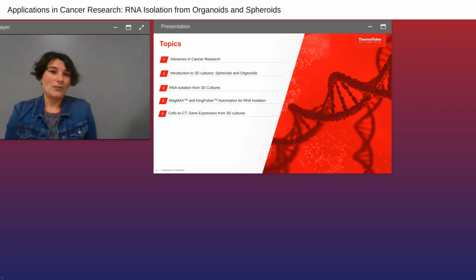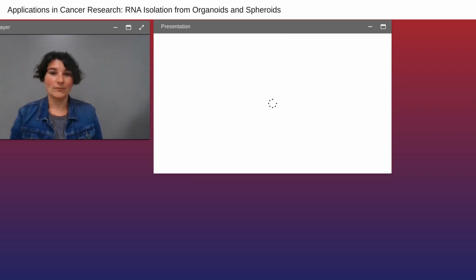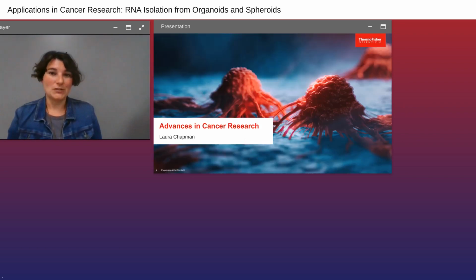This is a brief overview of our agenda for today. We'll give an introduction into cancer research, and then an introduction to organoids and spheroids. Then we'll move into some of the data that we've generated here for RNA isolation from those 3D cell cultures using standard spin columns or TRIzol, as well as some of our higher throughput methods using the KingFisher Flex and Duo, and also a lysate-based method with Cells-to-CT. So again, thanks for joining us.